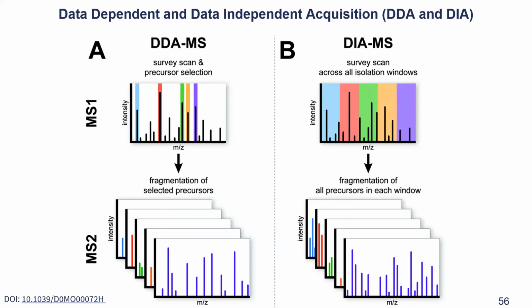As I mentioned already, DIA, data-independent acquisition, is becoming more and more popular, especially in the proteomics field. It's a standard now, where you do not make this precision decision on the fly about which ion to fragment, but you just fragment everything that comes in at the given potential. You basically switch the quadrupole for particular windows. Depending on the DIA method you're using, they're either large or now getting really small, since the scan rate of the latest generation of mass spec is tremendous.